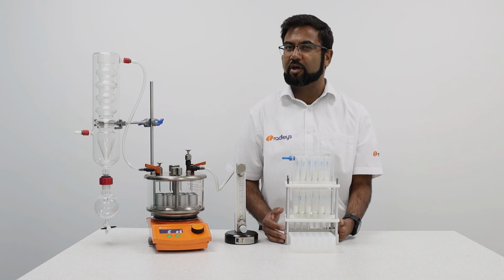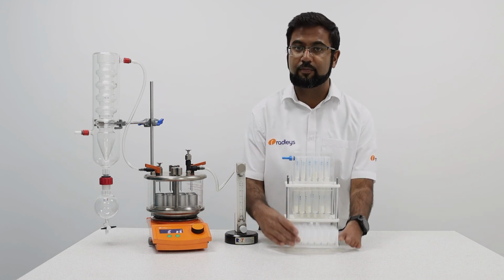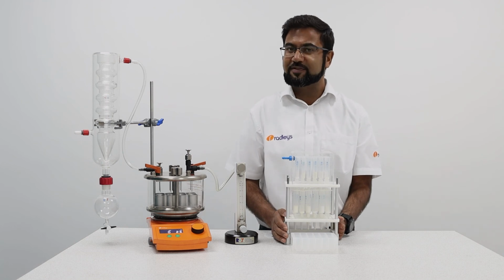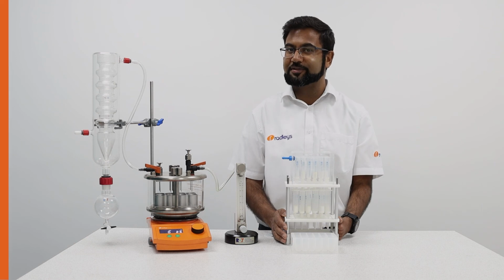Once you have completed your workup and your purification, take out the collection rack, and if you wish to evaporate these 24 samples in parallel, please watch our video on the greenhouse blowdown evaporator.